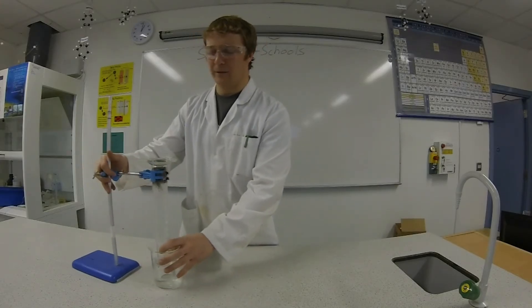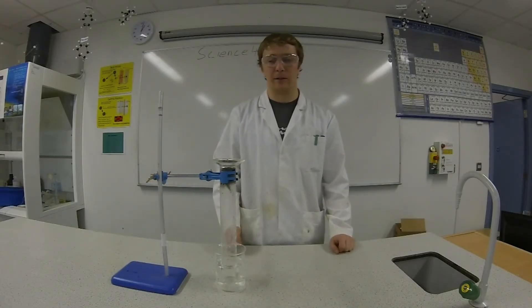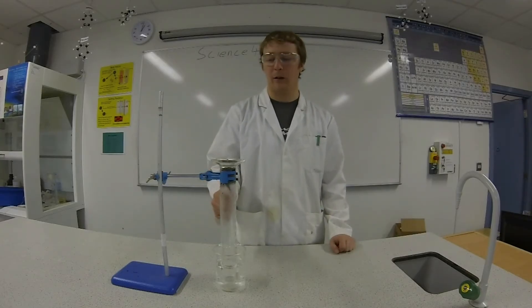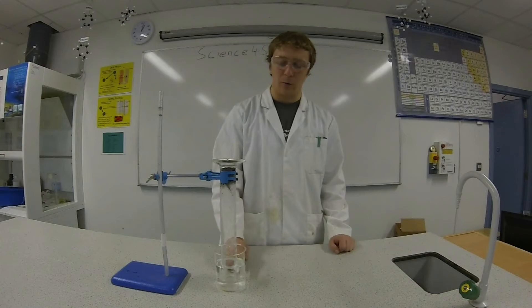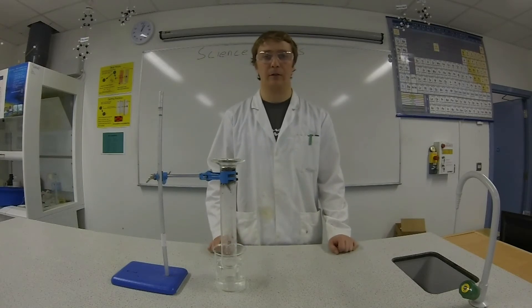Now you're going to have to leave this for a few days — overnight, maybe a couple of days — to see the results. What's going to happen is the steel wool is going to react with the oxygen in this graduated cylinder to produce iron oxide, which is rust. So the oxygen will get used up and then the water will displace all the oxygen that was used. So we'll come back tomorrow and see the results.